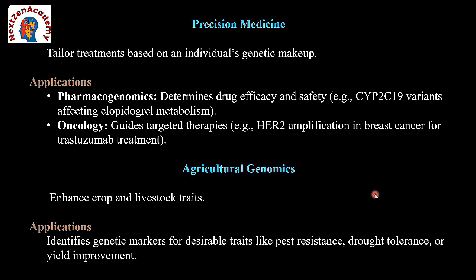In identifying genetic mutations in diseases, researchers studying genetic disorders and very complex diseases find NGS variant calling helpful.